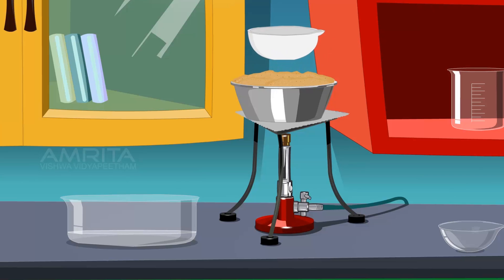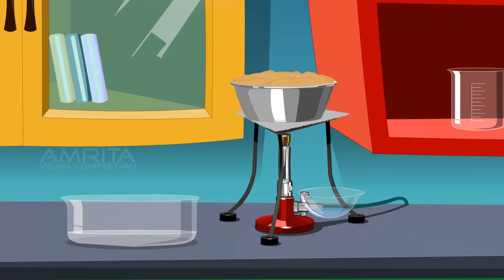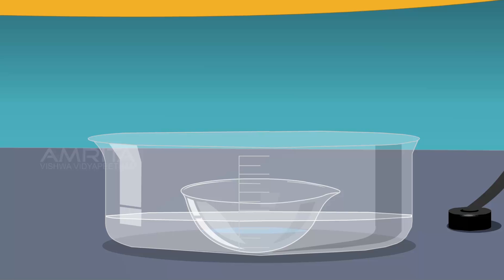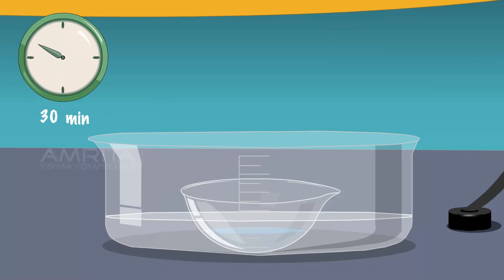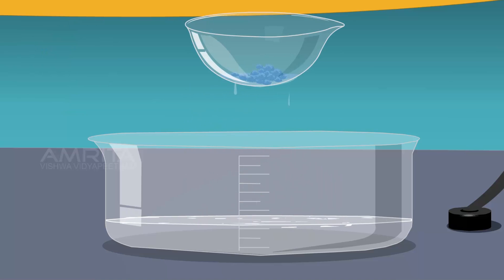Now turn off the burner and stop heating, and transfer the hot solution into the crystallizing dish. Place the crystallizing dish containing hot saturated solution on the trough half filled with water. Allow it to cool slowly for some time. Deep blue crystals of copper sulphate will separate out. After about half an hour, the crystallization is complete.